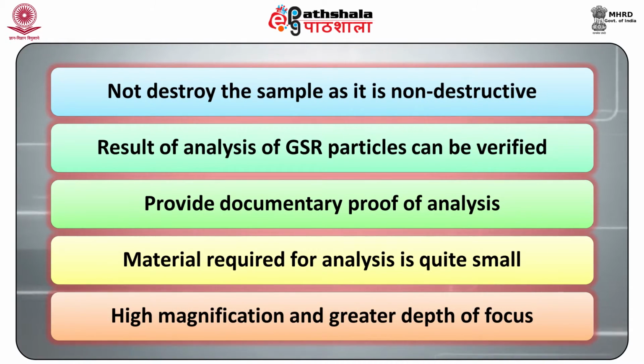Number one, it does not destroy the sample, as it is non destructive. Number two, the result of analysis of GSR particles can be verified if required at any time. Number three, it can provide documentary proof of analysis. Number four, the material required for analysis is quite small. And the last one, SEM has a very high magnification, better resolving power, and greater depth of focus.